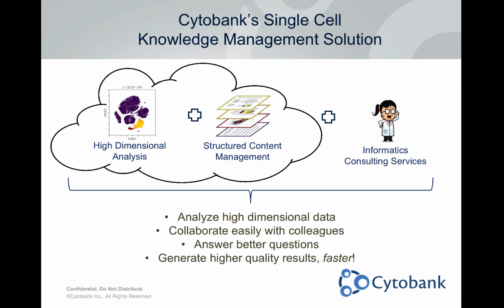Just getting started, in case you're unfamiliar with Cytobank, I'm sure a lot of you have at least seen Cytobank before, but if you're just joining us, Cytobank is a web-based platform for data management, high-dimensional analysis, and archiving. So we have a couple different pieces of our software in our company. The first, like I mentioned, are high-dimensional analysis tools. These are things like Citrus, SPADE, and viSNE. These are useful for looking at really complex experiments.